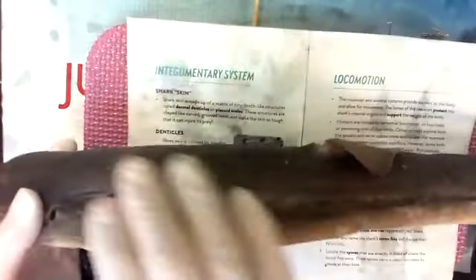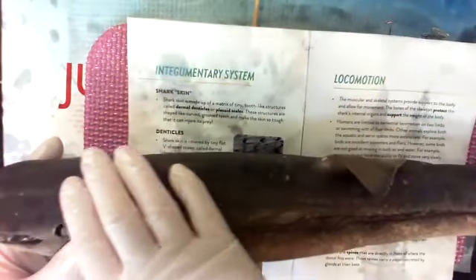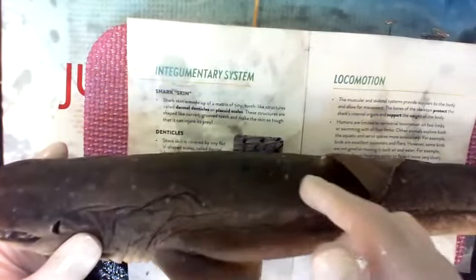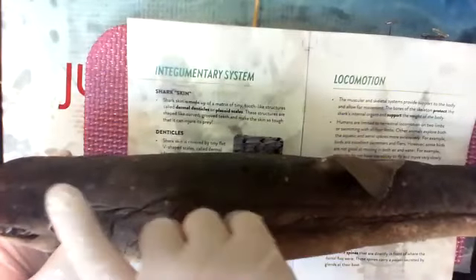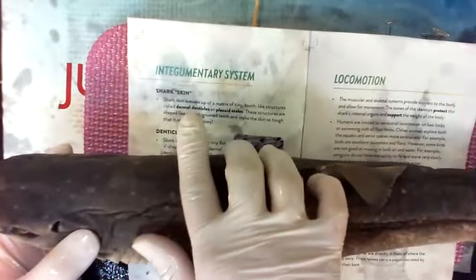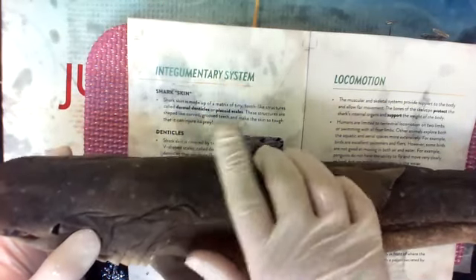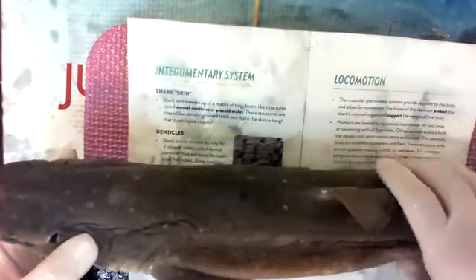So you've already figured out it feels like cat tongue if you go backwards, right? If you go forward and feel it, it's pretty smooth. If you go backwards, kind of hear that scratch. It's like nails on a chalkboard. It's because these scale-like structures are special, really special. We call them dermal denticles because the name actually tells you what they are. Placoid scales just mean plaque-like scales that overlap.